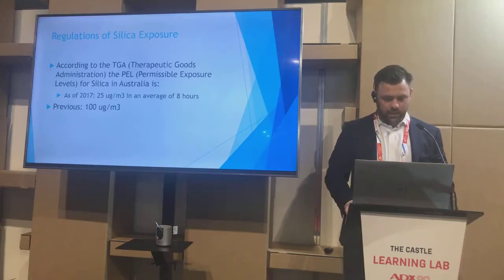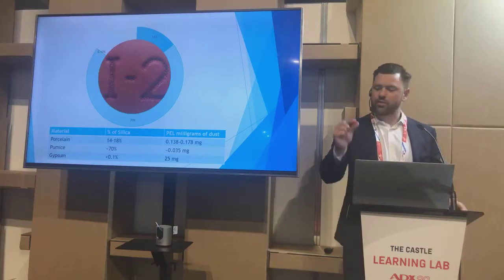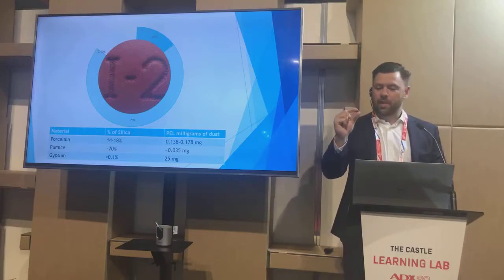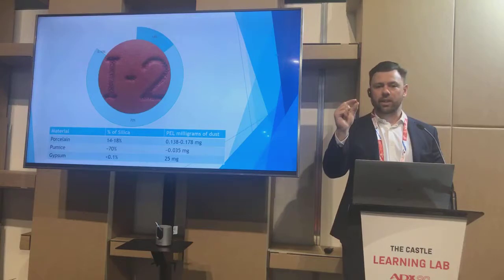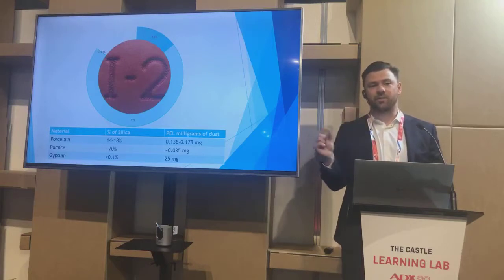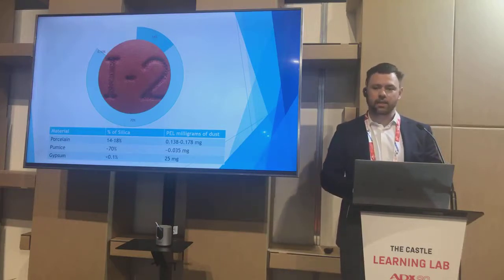Now, to give you an idea, this is a 200 milligram ibuprofen. You can see I've blown it up on the screen here. And 200 milligrams doesn't seem like a lot if you look at it. And the regulation says it's 25 micrograms. That's moving the decimal place over 3 spaces. And porcelain is 14 to 18% silica dust.